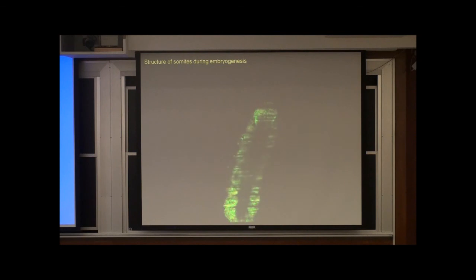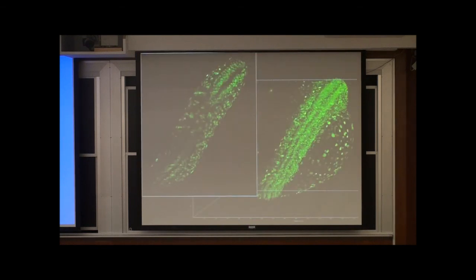So even in the later stage, we can see the somite structure. It is a Z stack. You can see in the spine individual somites, with two color imaging: red is histone, and green is membrane tagged. Although in the later stage you can't see individual cells once you see the whole projected view, in each of the planes you can understand individual cell localization and how their shape is in different areas of the tissue.